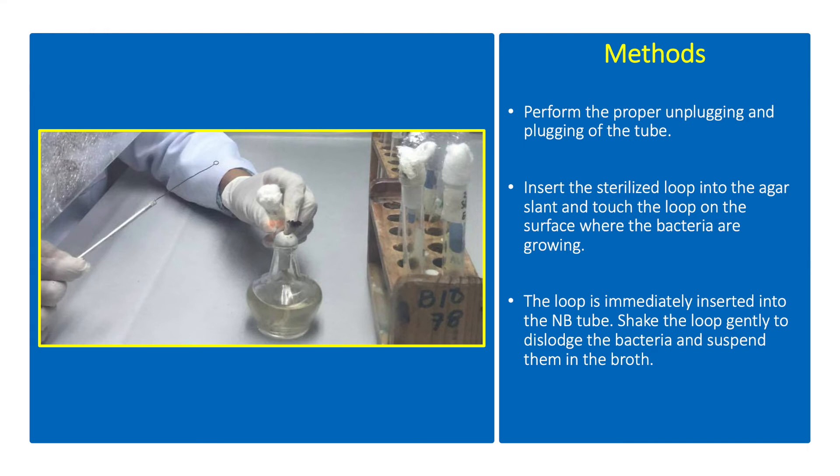Perform the proper unplugging and plugging of the tube. Insert the sterilized loop into the agar slant and touch the loop on the surface where the bacteria are growing. Immediately insert the loop into the NB tube. Shake the loop gently to dislodge the bacteria and suspend them in the broth. Withdraw the loop from the broth tube and flame sterilize.